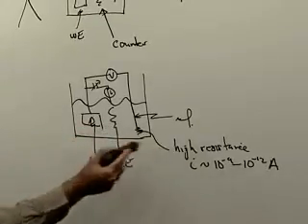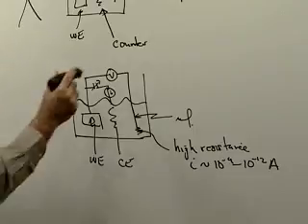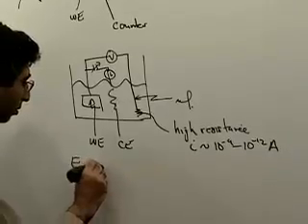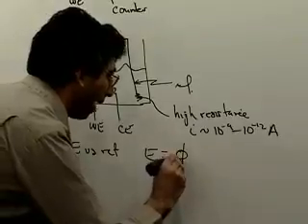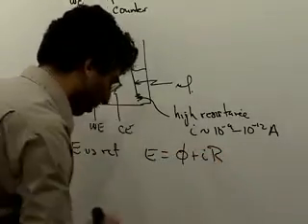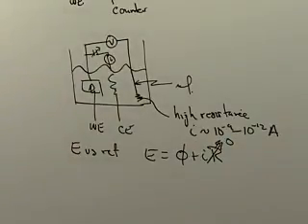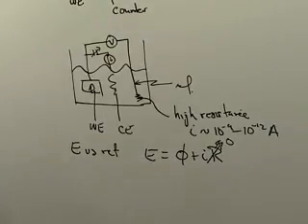Now, since that resistance is high, R will be a large number, but it guarantees I will be a small number, and as a result, I times R is a small number. And so now, when my undergraduate reads E here versus my reference, even though E is equal to the actual potential of interest at the interface of the working electrode plus IR, we can ignore that last term. Okay. So we have a potential compensated circuit now. Okay. Now we have a potentiostat, as long as we can keep our undergraduate there, right?